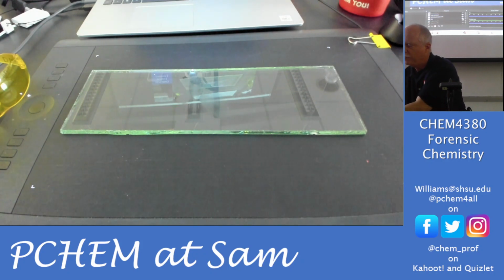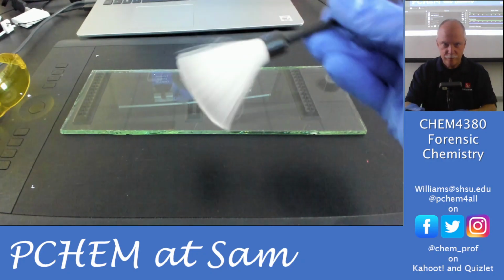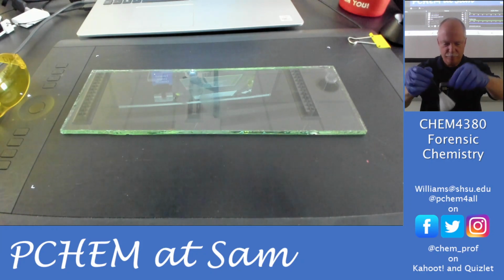And I've got this glass fiber fingerprint brush. There we go. So I'm going to just get just a touch of this powder. I'm not even going to stick it in there. I'm just going to touch the lid. Okay.